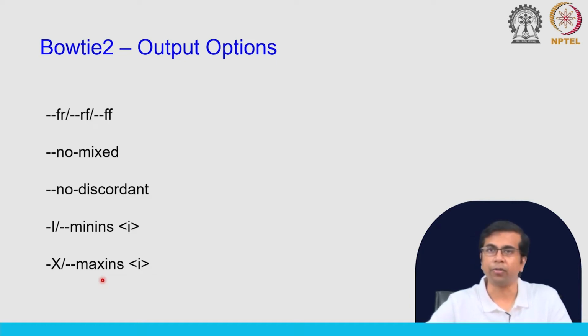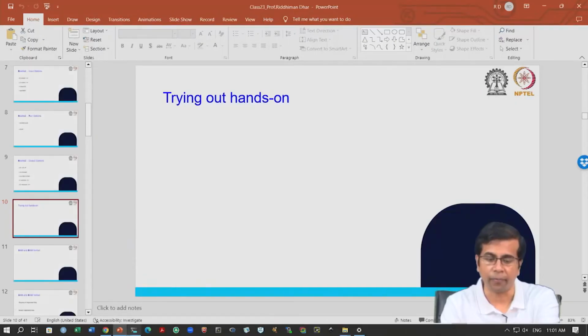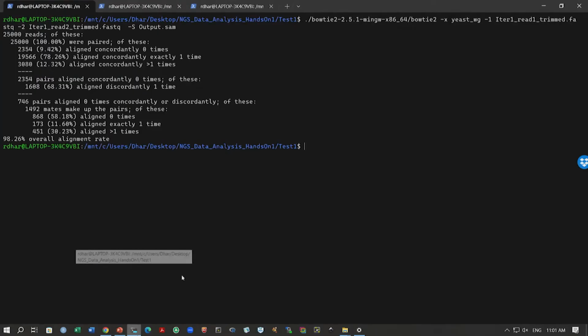So, what we are going to do is try some of these variations, because they are useful, and you will see how the results change. Let us move on to the terminal and see how these options change the output.